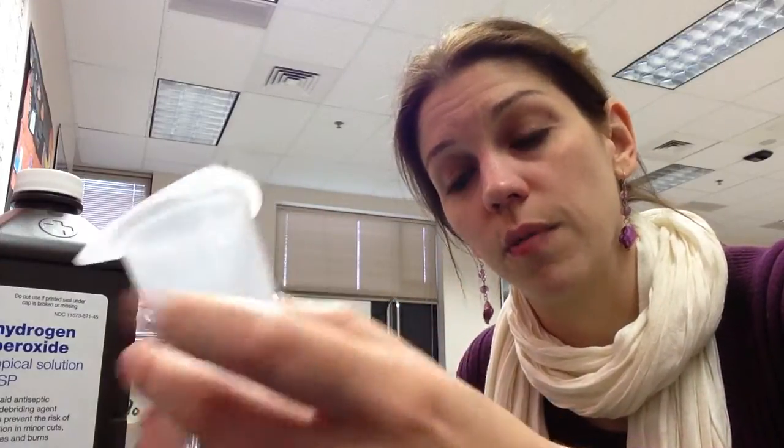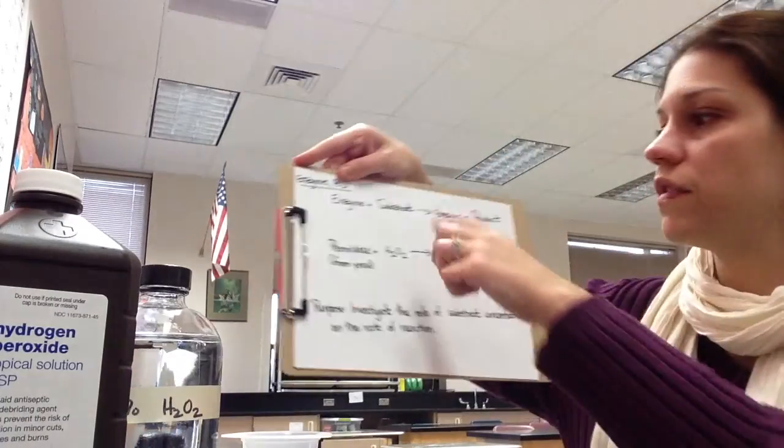You can get all of your substrate at once if you would like. And you're going to be measuring 3 different things. Your control is going to be your DI water in your beaker, and then you're going to be measuring 2 different concentrations of substrate.